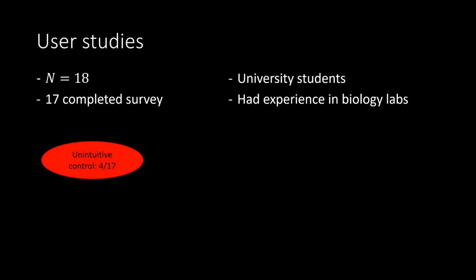Another common suggestion from users was to increase the magnification so they could see the cells more clearly. This brings up an interesting point about choosing scaling in biotic setups. Because we're working with real organisms, we have to work with both their natural size and timescale. We want to choose a magnification where the cell responses are noticeable to people. This depends on the speed of the organism. If you're too zoomed in, the cell appears to be moving too quickly for you to interact with, but if you're too zoomed out, the cell is both hard to see and may not appear to be moving at all.